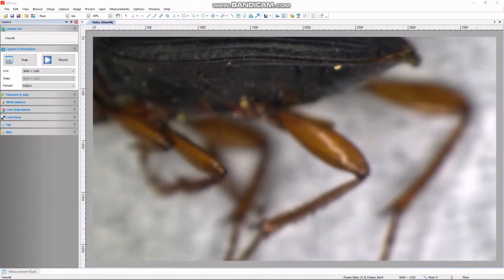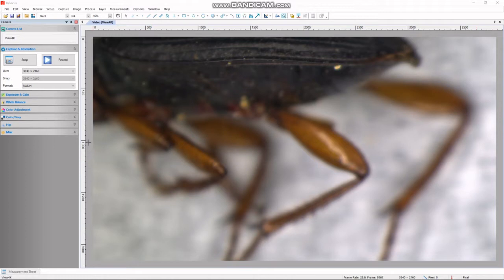In this video I will demonstrate how to create an extended depth of focus image in the In-Focus camera software. The extended depth of focus option combines a stack of partially focused images into one fully focused composite image based on pixel intensity or contrast. It's important to note that we need a good contrasting sample so the software can account for the different focal planes.